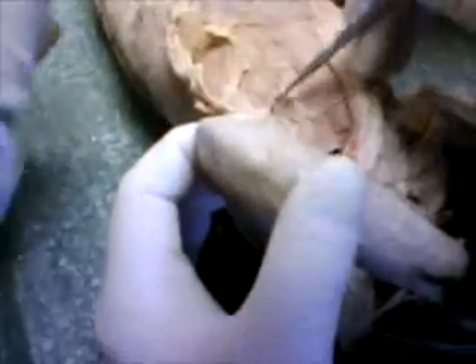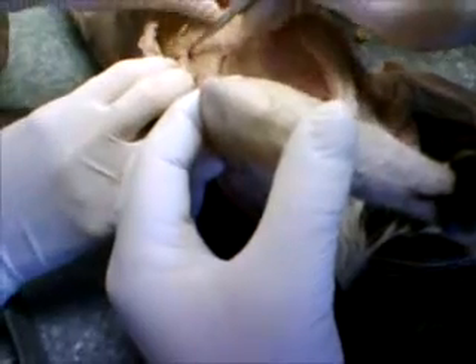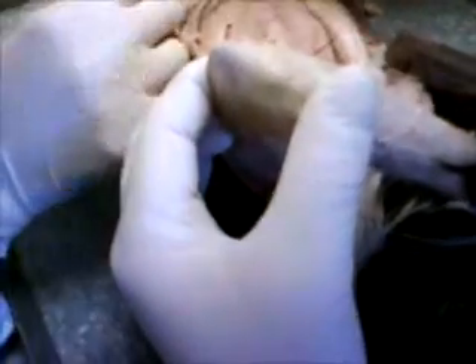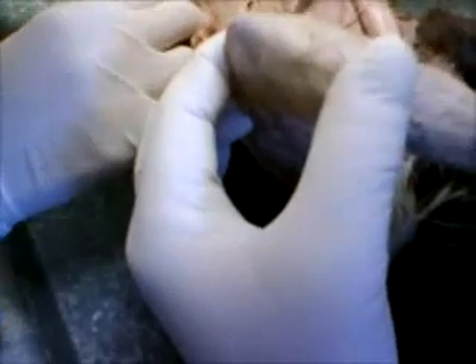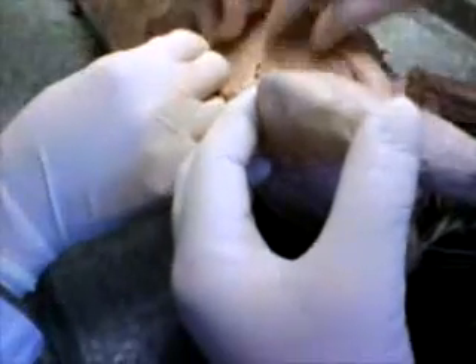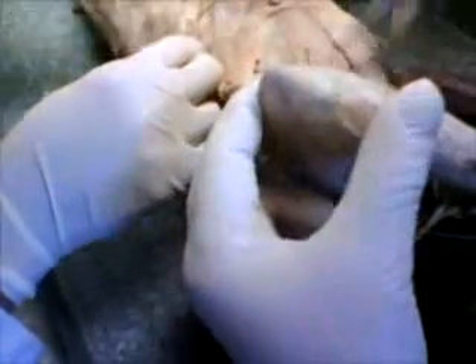Now these muscles, when you get this fascia off, these muscles will separate pretty easily — a lot of the time just with a probe. Now you've got a blood vessel — see this white blood vessel that comes along here? That tends to kind of block you from separating. But if you get that out of the way, then you should be able to separate. And you're going to go right down each head of the muscle, just like that.